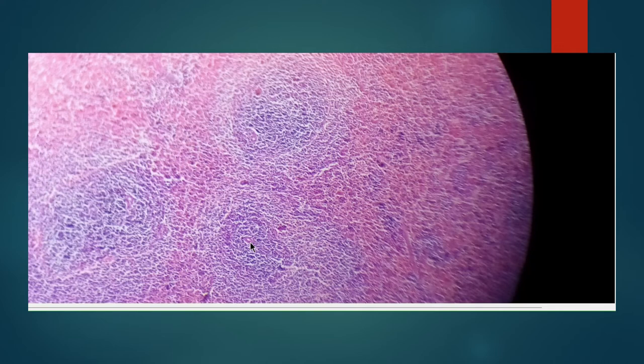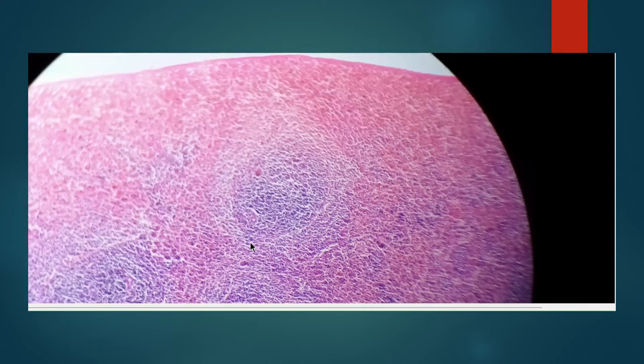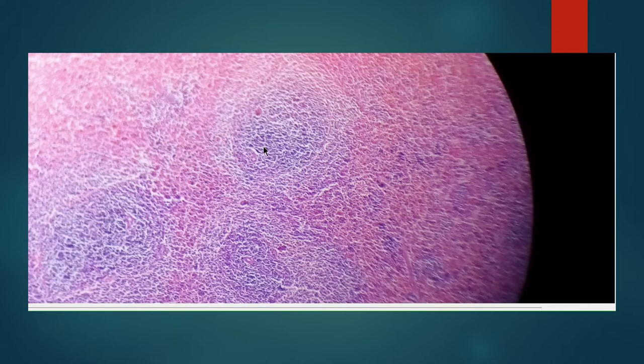So presence of central artery, identify the capsule and the lymphatic nodules. And you can identify the lymphocytes which are present here. That is the white pulp. And surrounding that artery also, we can identify some lymphocytes. They are called the periarterial lymphatic sheath. So that is nothing but your spleen identification.